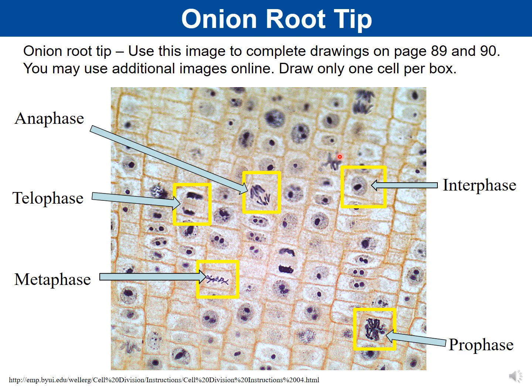So if you look at this other diagram, can you locate one other cell that is also in metaphase? Look around and see if you can find another example of this. One of the best examples I can see is this one here. It's not quite in focus, but you can definitely see that they're lined up in the middle. So metaphase is the middle. They're lined up along the middle.